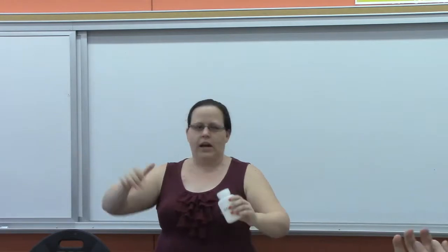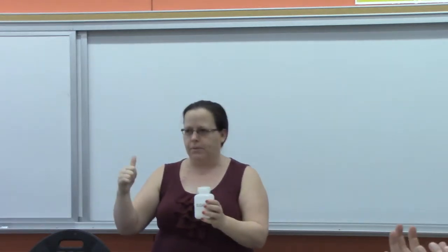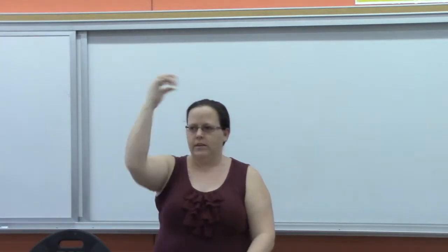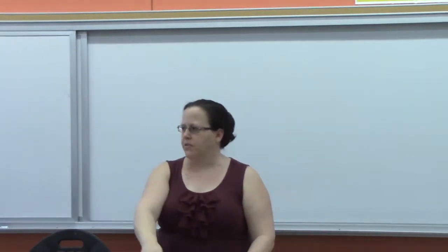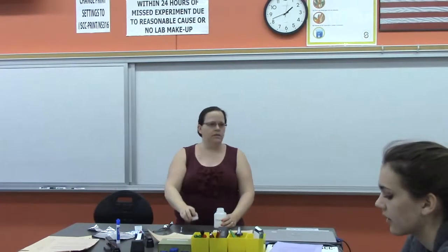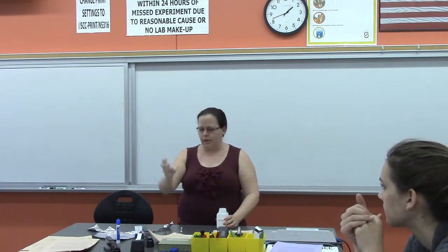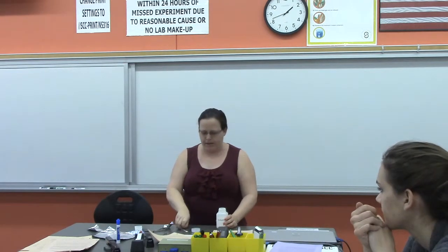Every person, I don't care if there's somebody behind you waiting for the same sample, you're going to open the bottles. You take the cap and put it top side down, because what happens if we put it with the bottom side down? If there's junk on the counter, now it's back in the bottle, right? So you either hold the cap in your hand, or put it down top side down.